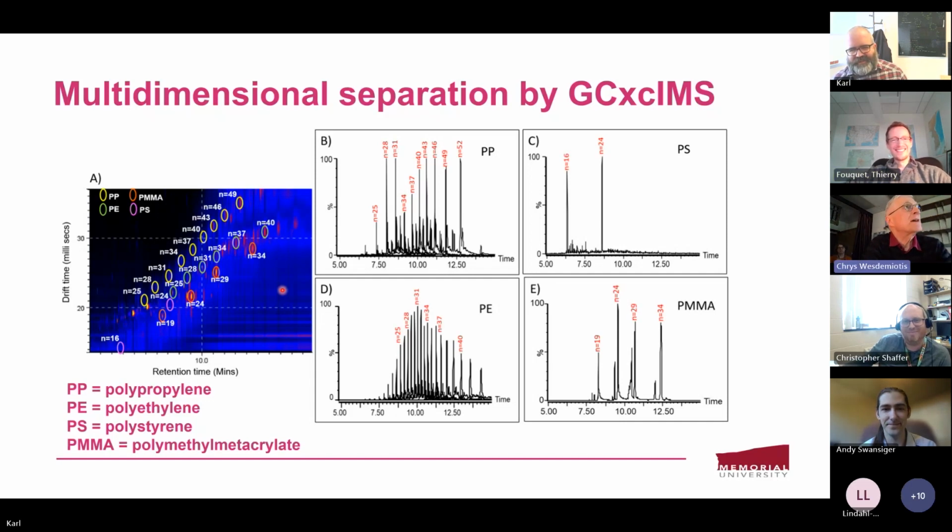Actually, thank you for showing the spectra again. That could explain the nice response for polystyrene. It's essentially monodispersed in the pyrolysis product, just those two products. So all polystyrene goes to the dimer and trimer. You get the distribution with the other ones. It's like having a monodispersed polymer versus a high polydispersity. So that could also have something to do with the detection efficiency. Polypropylene and polyethylene, you spread over many oligomers, and polystyrene is the nicest one, where you get only two out of that. That's a good point.